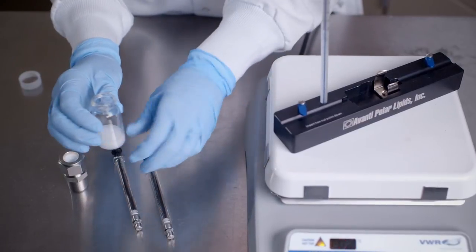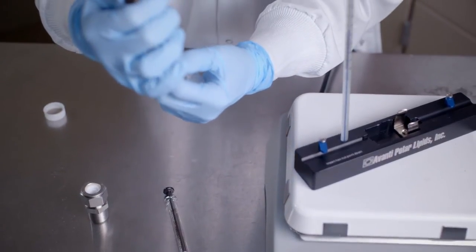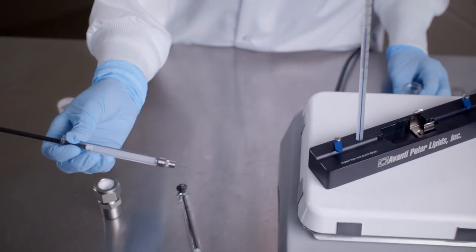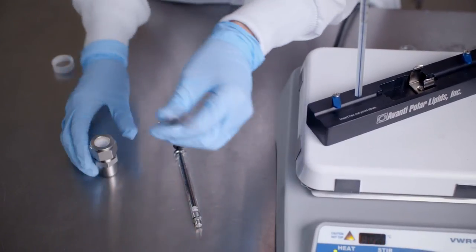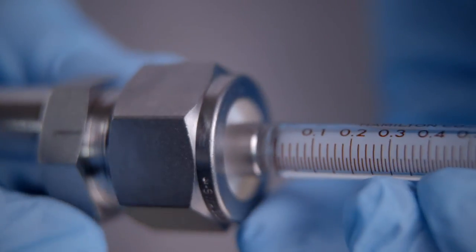Once the sample is fully hydrated, we will load it into one of our gas-tight syringes. Carefully insert this gas-tight syringe into one end of the extruder. As a quick tip, in order to reduce the dead volume, pre-wet the extruder parts by passing a syringe full of buffer through the extruder and then discarding the buffer. Additionally, new syringes may have tight-fitting parts, so to facilitate extrusion, it may be necessary to pre-wet the barrel and plunger with buffer prior to inserting the plunger into the barrel.